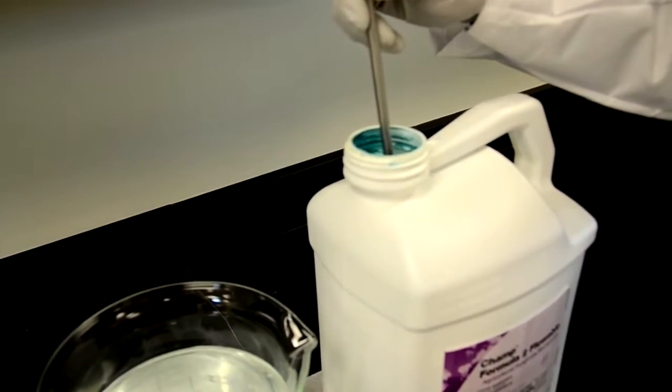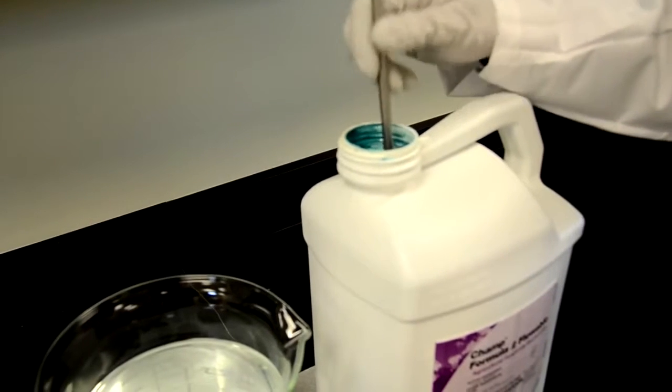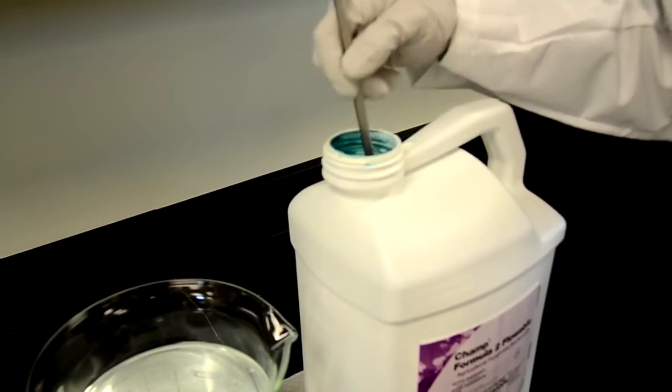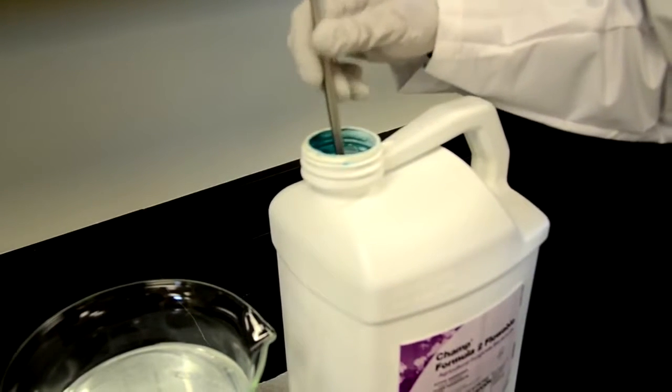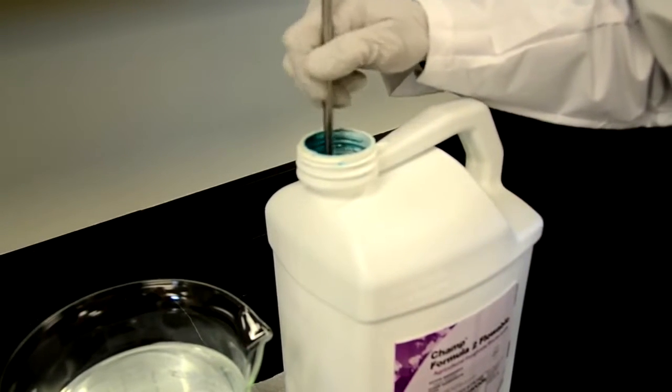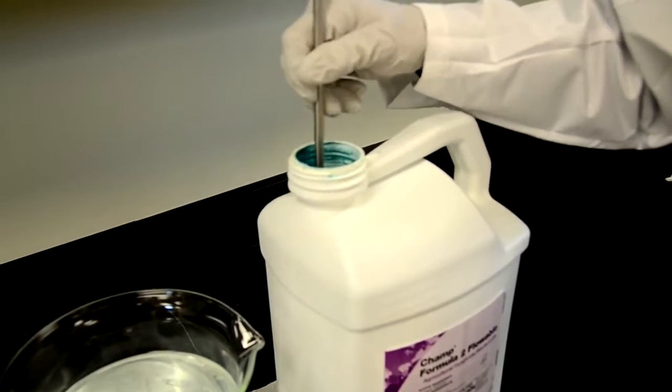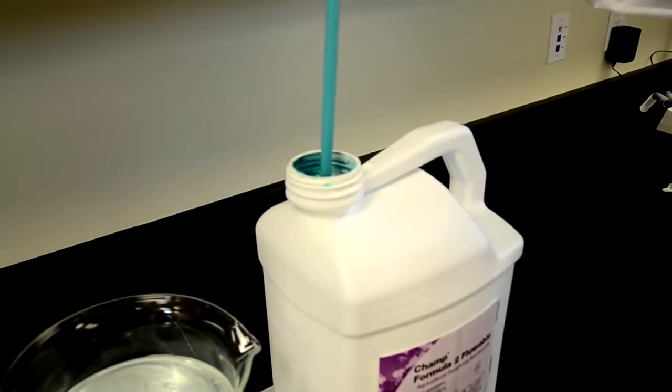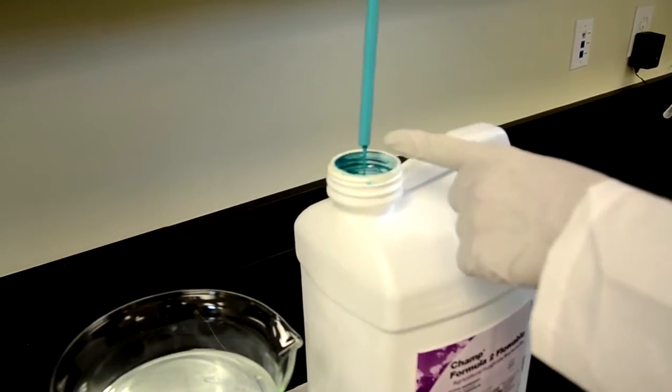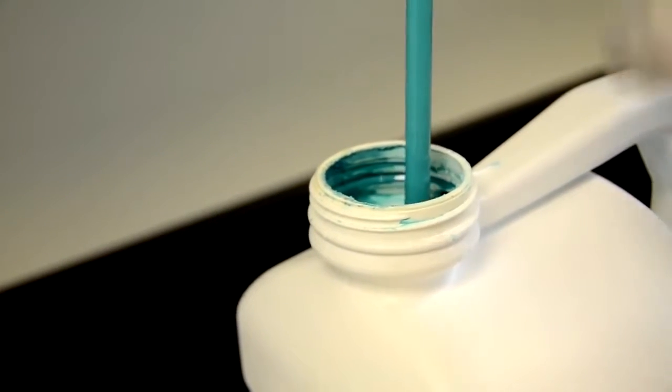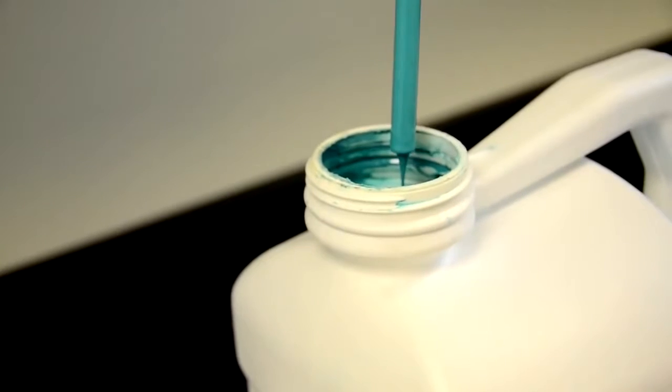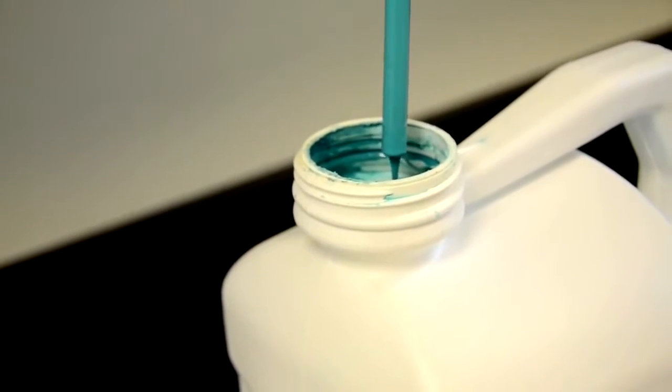When we do this test we put the probe in and we tap on the bottom. If you hear a clear tapping sound that means there's no sediment. Then we move the probe around and pull the probe out. If there's nothing on the base of it we know that there's no sediment. Notice how the rod is perfectly clean or uniform down through the bottom.